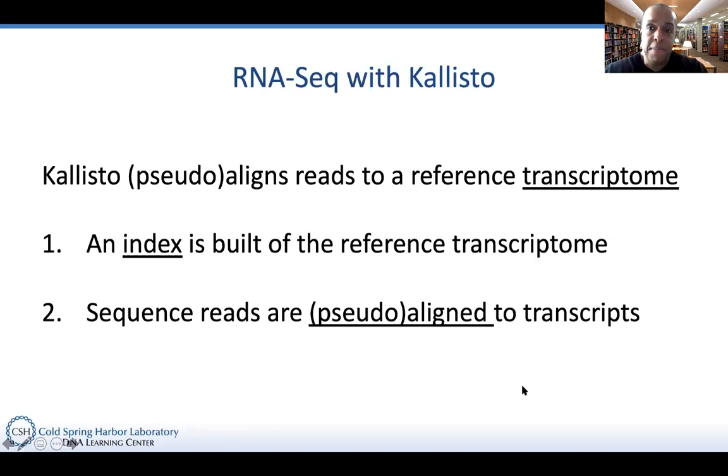There are a couple of steps. That's the other reason why we do this, because some analysis software can be many, many steps and many parameters, but this one doesn't have that many. You're going to build an index. So what you're going to do is align against your transcriptome, which is the sum of all of the known transcripts, generated from previous RNA-Seq experiments.